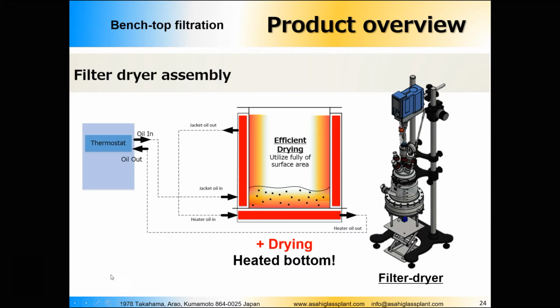The connection design is shown here, so everything is pretty simple. No need to stop on that. So we heat up the bottom, we heat up the jacket, and that's how we get efficient drying. When do we need the filter dryer? This was mentioned actually in the beginning of the presentation. So we need the filter dryer when we need to protect the sediment, the substance that we are filtering.